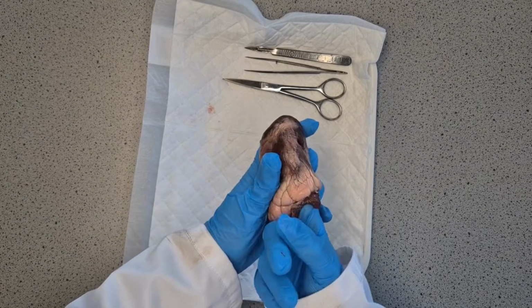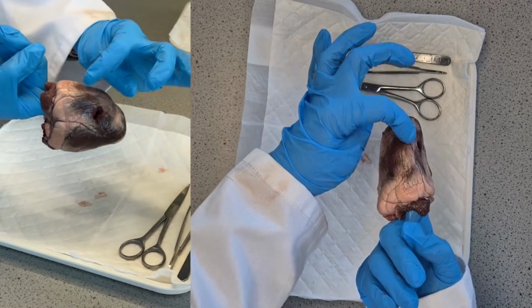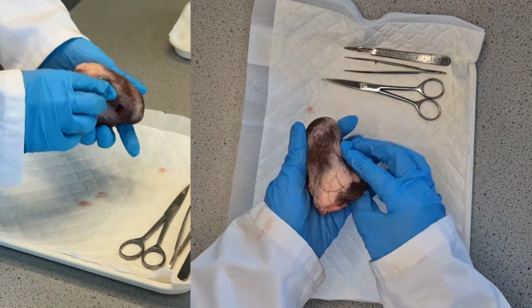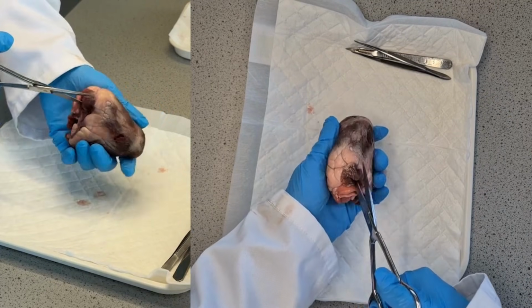So now, same thing again, I've put my finger through the atrium, so I know that that's definitely going to go down into the ventricle, and I'm going to cut through this bit, and I think this is the left side, judging by how thick it is, so this must be the right. So let's have a look just to confirm.